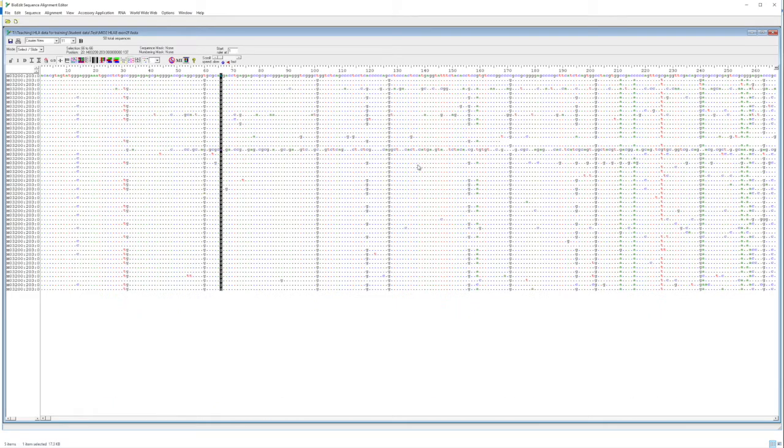The second thing that stands out to me is that we have this short sequence here. I'm not sure what's caused that, but in a file where you have plenty of reads to do what you want, probably the short sequence would just be ignored.